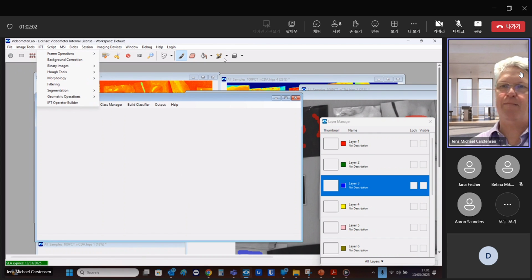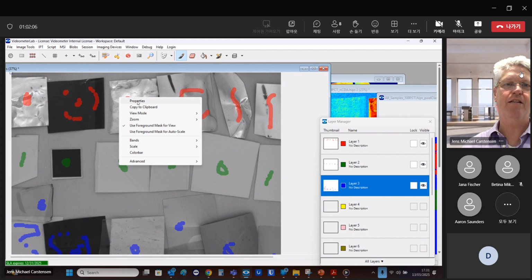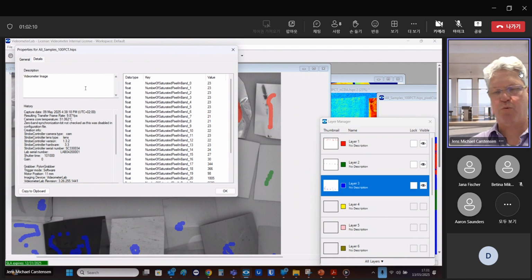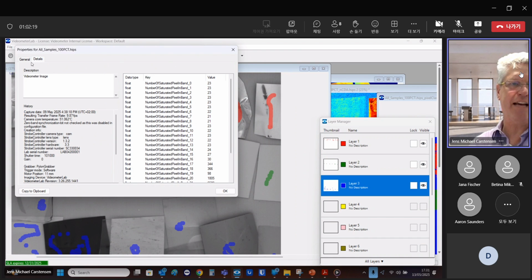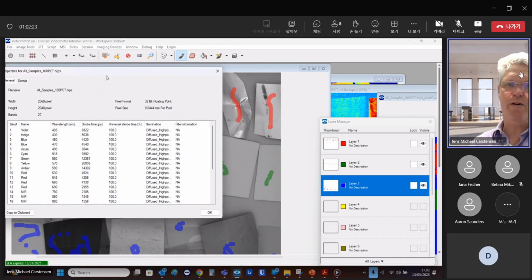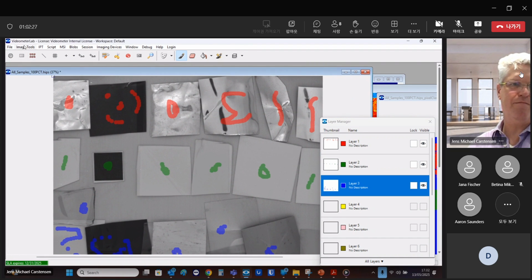Let's say you want to add a comment to all images. Images have some description that you can see here under properties. Let's say you have some description that you want to add to all the images in your folder so that you can later on recognize that tag. Then you can put in tags in one or many images in the same function.